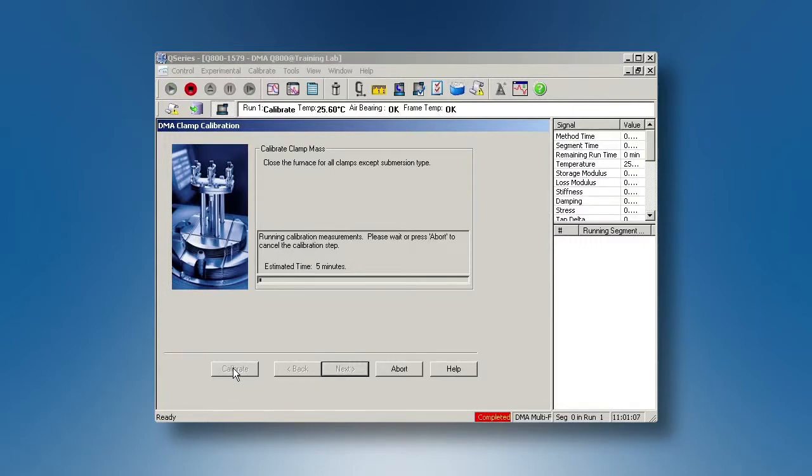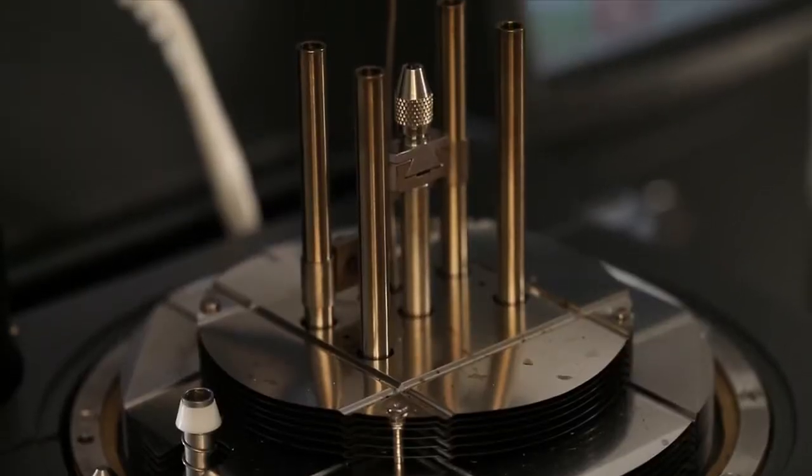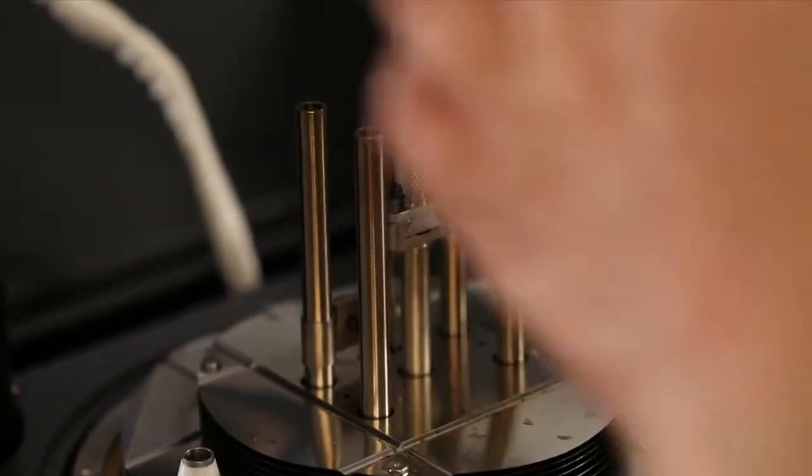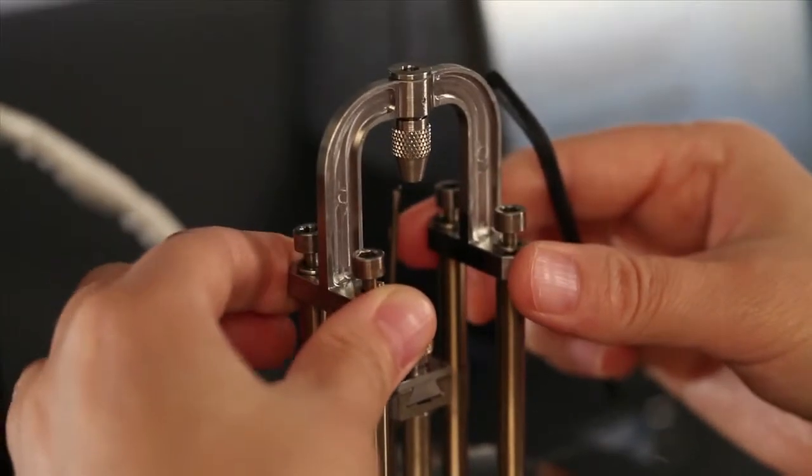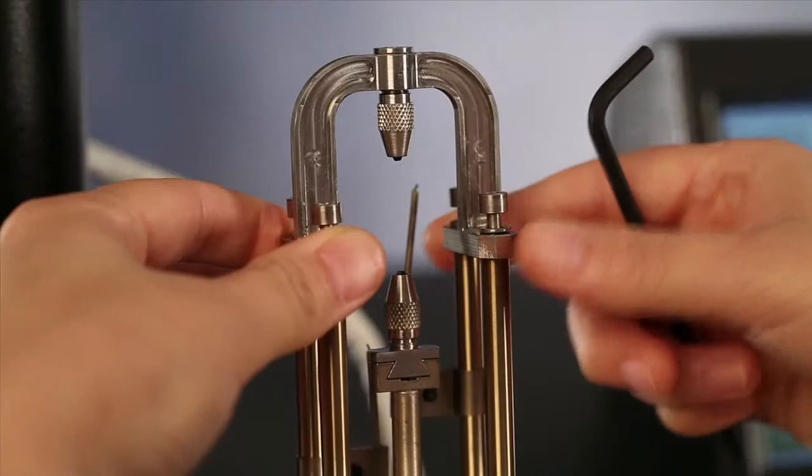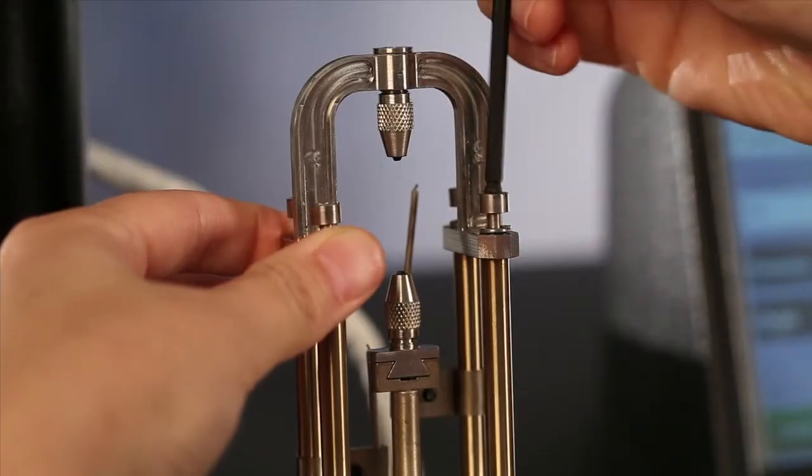This first calibration step is to calibrate the mass of the movable clamp. For clamp zero calibration, install the stationary clamp to the instrument.